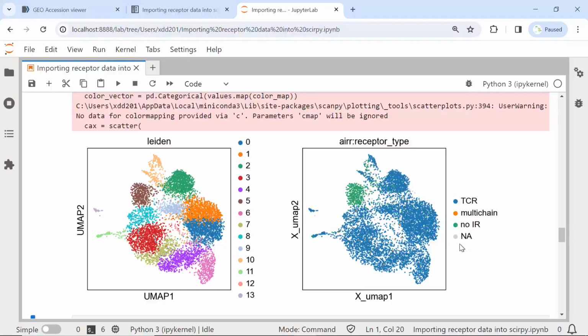Okay, I used one dataset as the demonstration dataset from the GSE139555 dataset. I showed you how to load both single-cell RNA sequencing data and TCR sequencing data and combine them into mdata. Then we analyzed both.